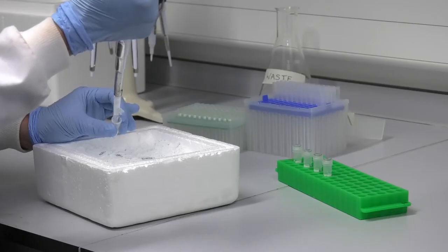Step 6. Remove debris by centrifuging at 13,000 times G for 3 minutes and transfer the supernatant to a screw cap tube.